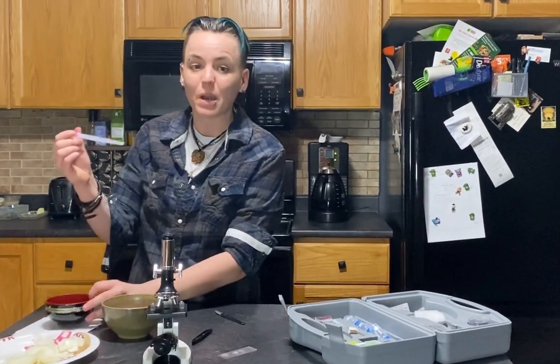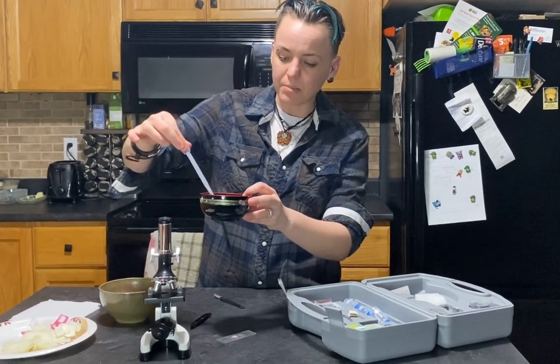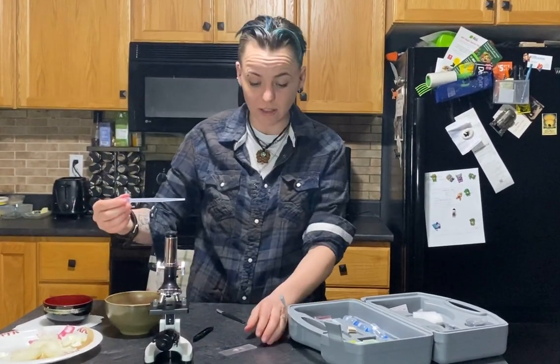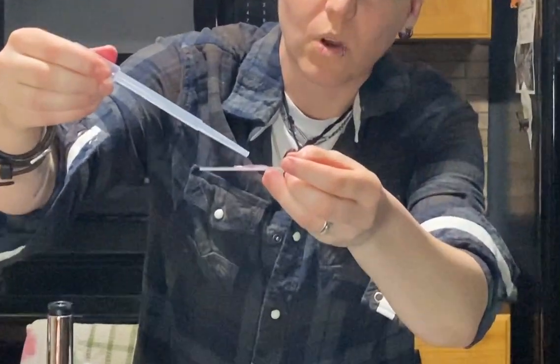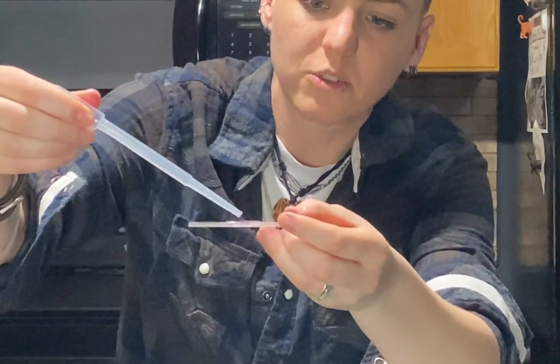You're going to want to take your pipette — this is called a pipette — and squeeze the top of it, then draw up some water. This is actually what we do in science, and this is exactly the same thing I taught university students. So you're basically doing university right now. Take the pipette and just put a couple drops of water on the slide.